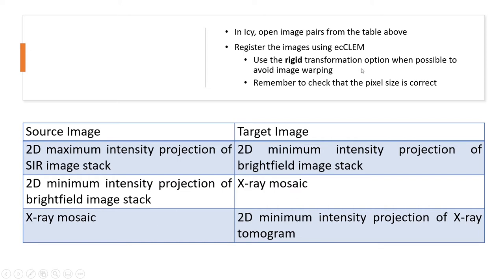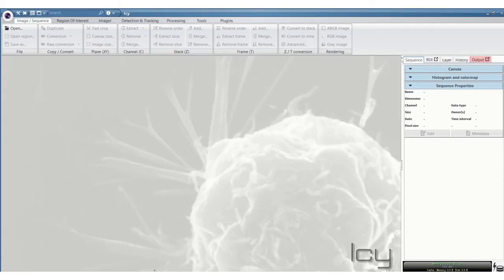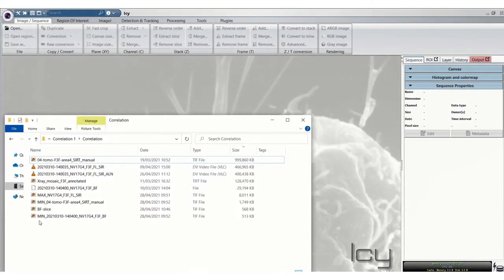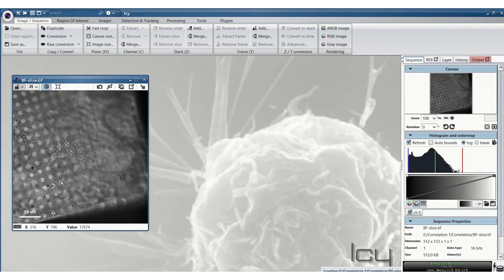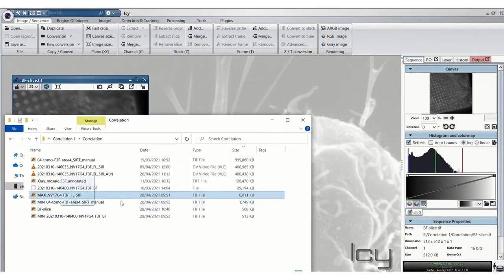Use the rigid transformation option here in EC-CLEM if possible. And check that the pixel size is correct. Because sometimes it's not correct and then this interferes with the registration. So first we'll do this with the brightfield and the SIM image. Open IC and drag the 2 images into IC.